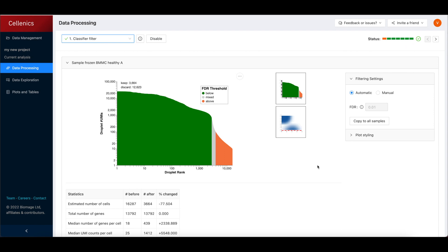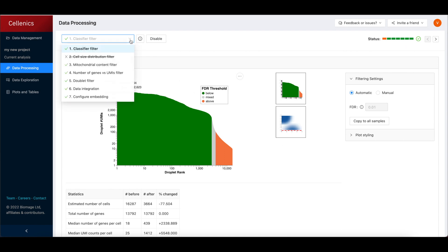The data processing module is where you can check the quality of your samples and adjust the settings for filtering, integration, and clustering. The Selenix data processing pipeline consists of seven linear steps.